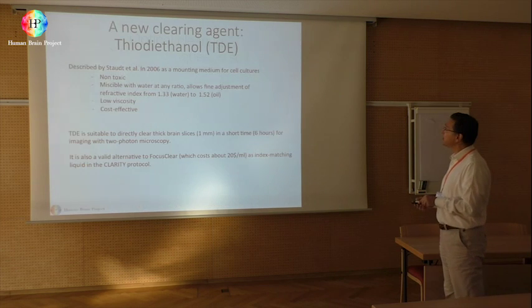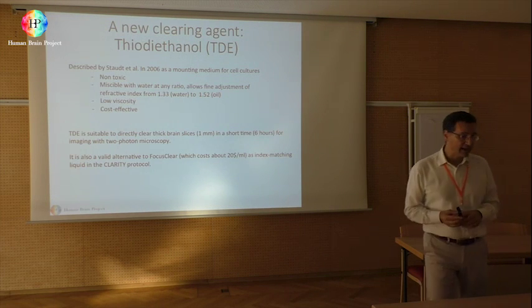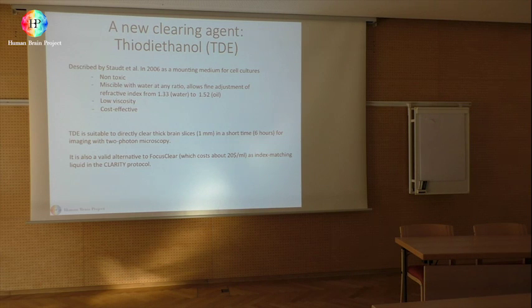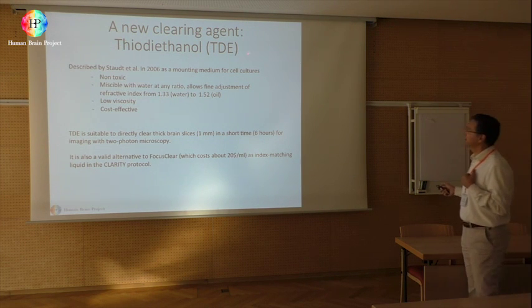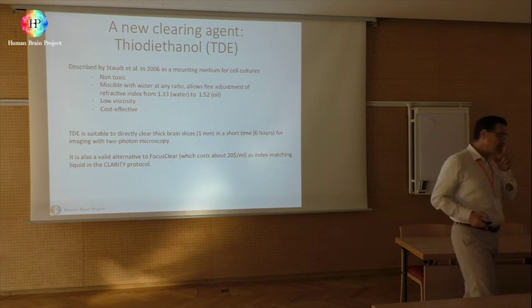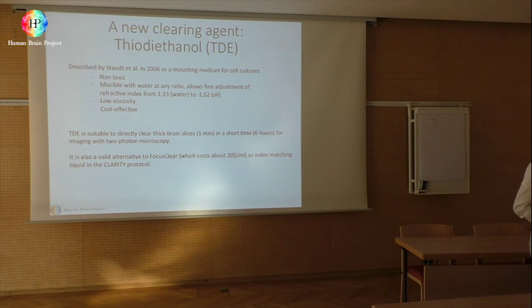So we set up a new kind of clearing, which is not new, but was new for the very first time in brain. This was used for single cell, and we use it for brain, which is called thiodiethanol, TDE. And TDE is able to clear the brain and can be used also with Clarity, okay? With the Clarity protocol.